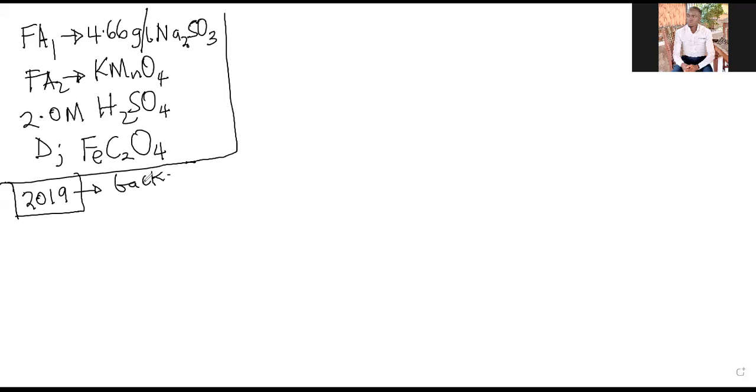So now they are giving us the theory, how a manganate reacts with all those. Procedure 1, members, just to know what takes you to the lab. If you don't know the aim, what takes you to the lab is to get 2 values, 2 volumes: the pipette value and the average value. Nothing else.